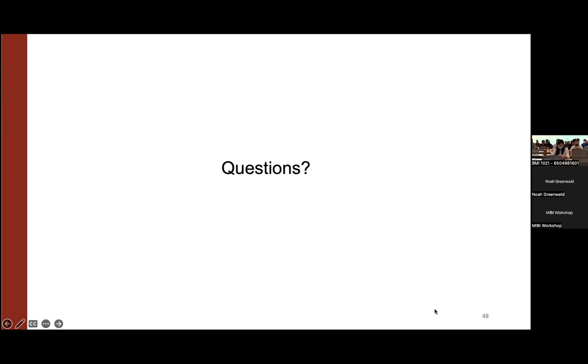Question: In some parts you mentioned that when the data set is large, you selected a subset of the pixels. Can you explain how you determine which pixels you select? Is it random, or do you downsize the image, like reduce your resolution by twofold or fourfold? Yeah, that's a good question. We just ran an example on an FOV basis. Doing random selection is definitely the simplest way of doing it. We thought about doing fancier, density-dependent downsampling, but because the random sampling seemed to do well, we didn't try to go down those other routes.